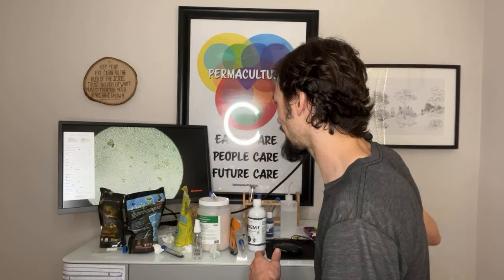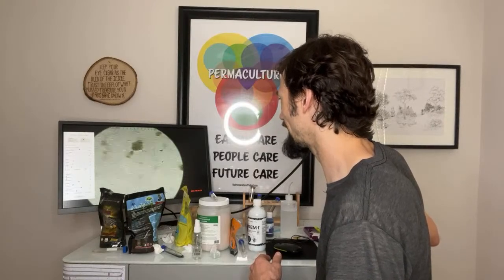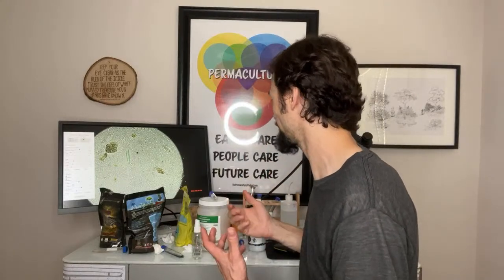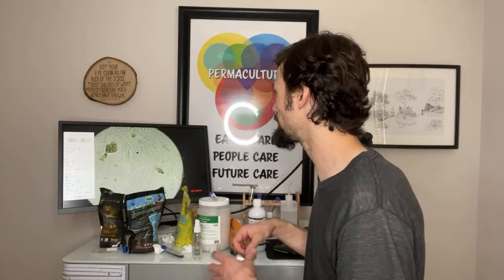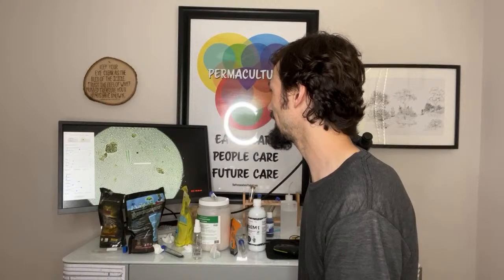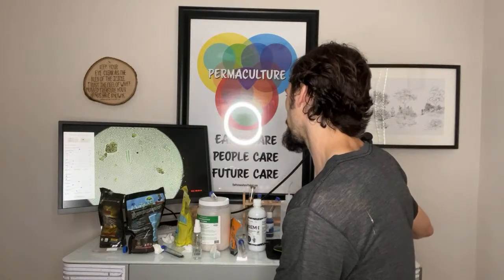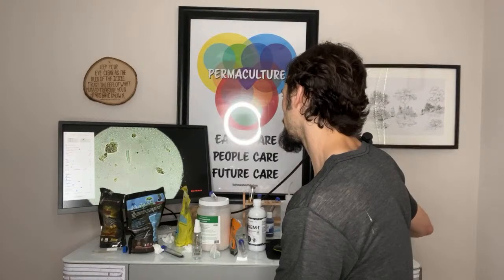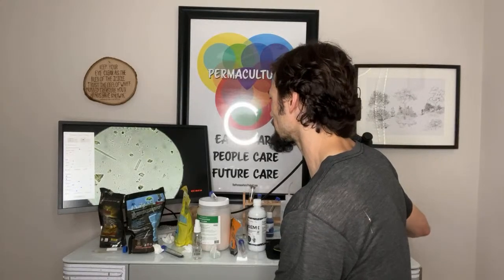This is all the same thing. It's very uniform. It's packed. Look at that. A crystalline dagger. It's like a giant, broad broadsword looking type thing. Yeah, it looks like a broadsword blade broken off at the hilt. It's ghostly pale. Look at that. That looks like a spore or protozoa. That looks like a testate amoeba. Right there. Yeah. And right there. Oh, interesting. That's a spore.